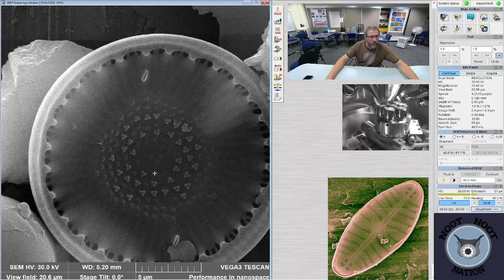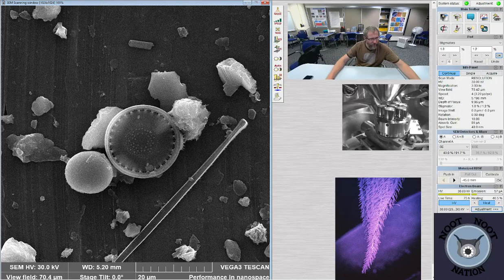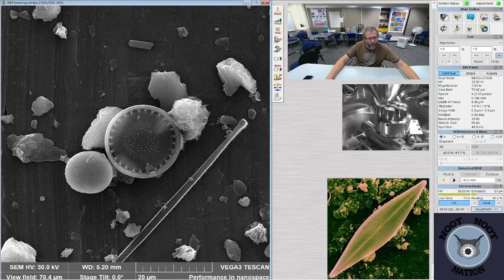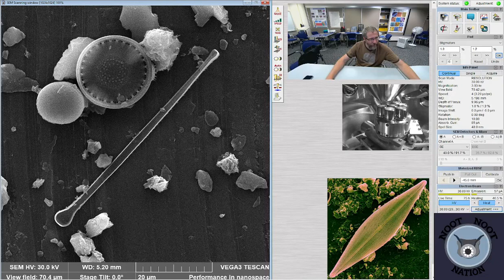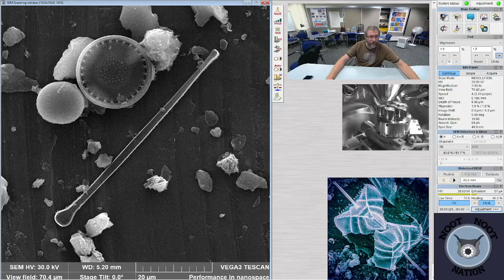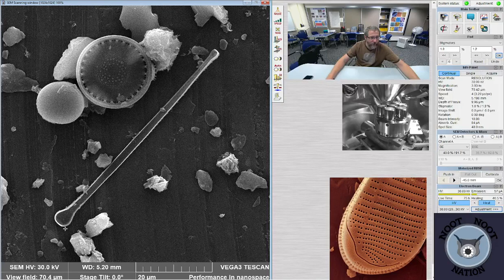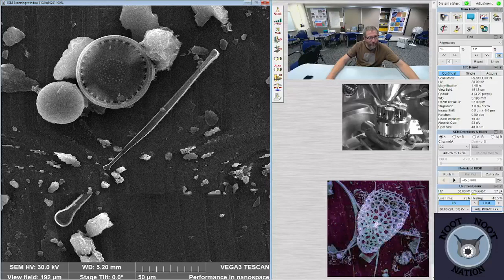So we're mostly looking at diatoms in these samples. This is Lindavia intermedia. I think that's actually a chrysophyte right there, a really large one. And then chrysophyte stomatocysts. And this one here is Asterionella formosa, which is a colonial diatom. They make a star shape. That's where it gets its name, Asterionella. They connect by this bigger head pole, which is actually a foot pole in this one for some reason, and then they radiate out from that in a star pattern.